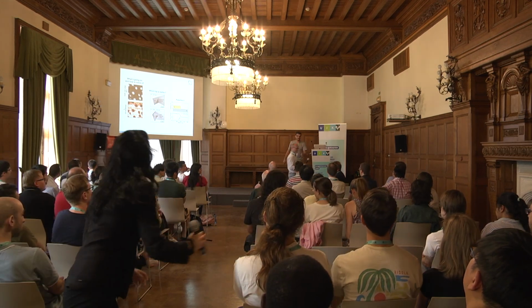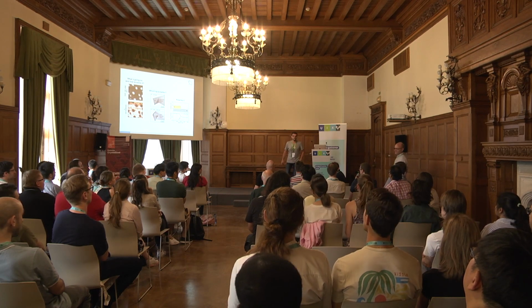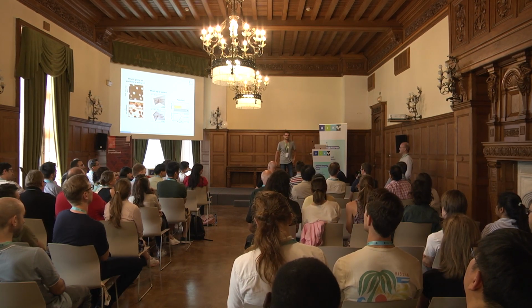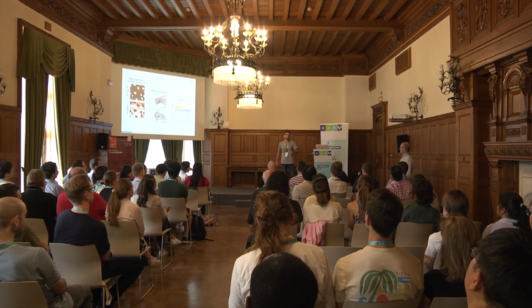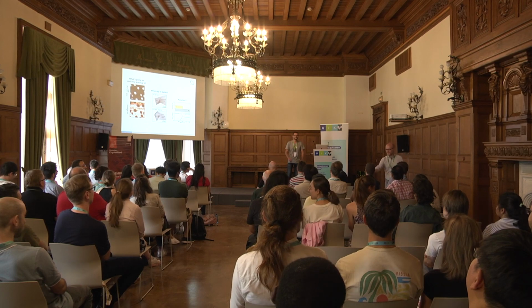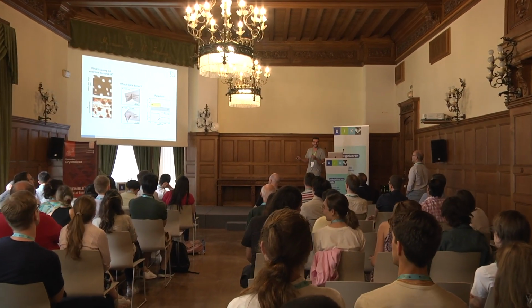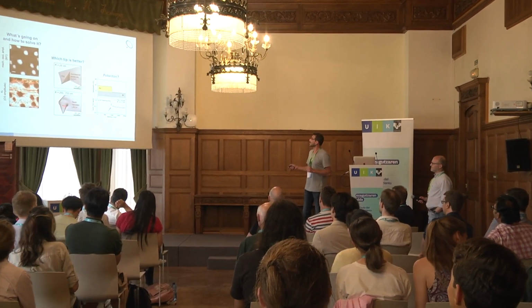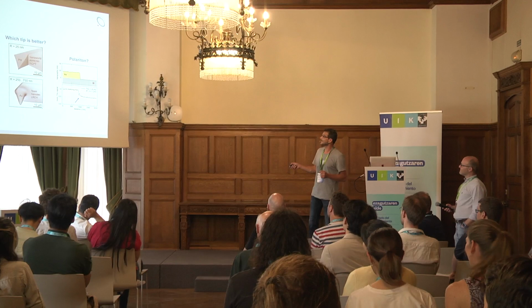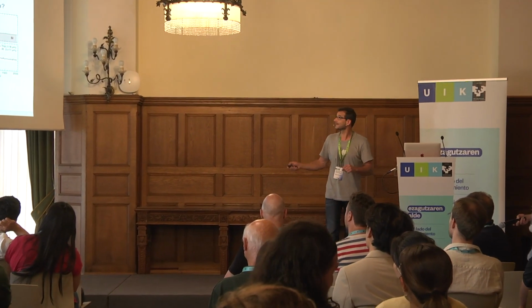Yeah. Yeah, it's also in the phase. If it's in the phase, then it might be switching between attractive and repulsive regime or vice versa. Bingo. I think here's the winner. So I will explain in a second in more detail. So, okay, good. We solved this very well. We have 1 out of 3 correct answers already. So now, polariton, which tip is better? Any point to this?